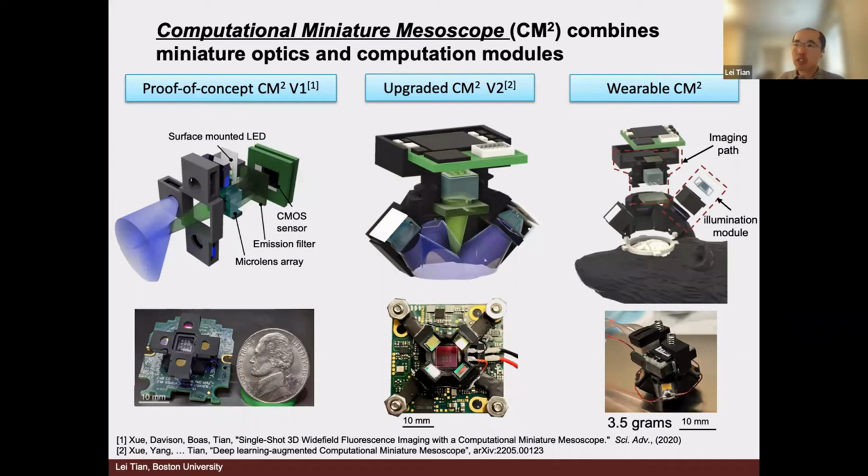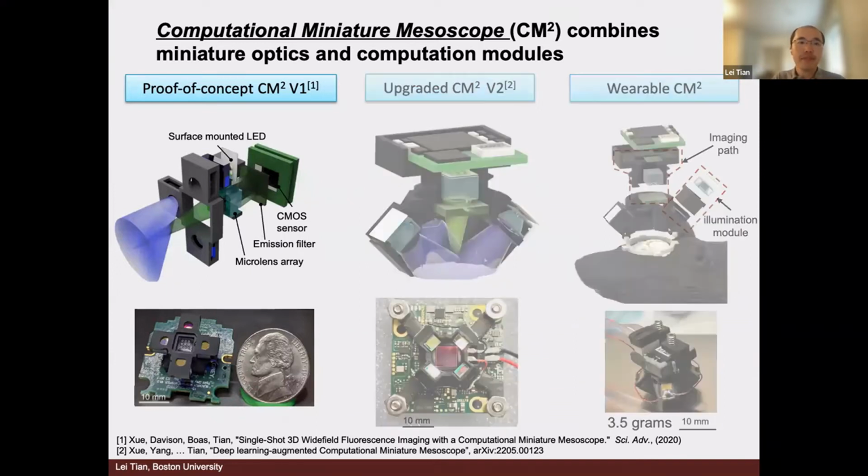Here, since we're talking about neuroimaging, the eventual goal is to capture calcium activity, so we're talking about fluorescent imaging. I'm going to talk a little about the model we're going to work with. You will see that they're slightly different because of the underlying difference in the image formation process.